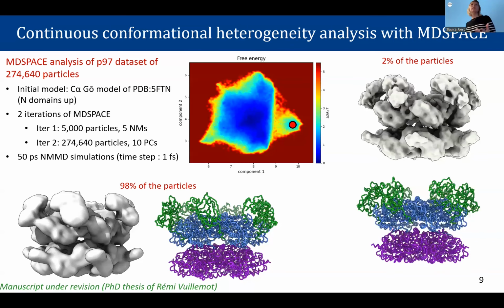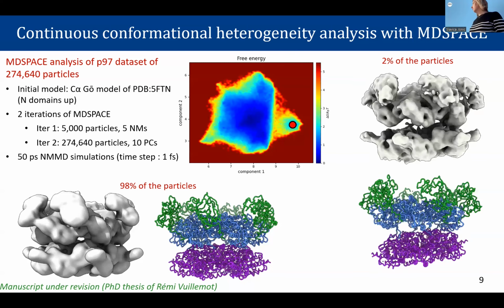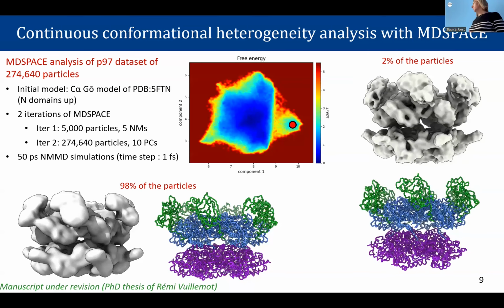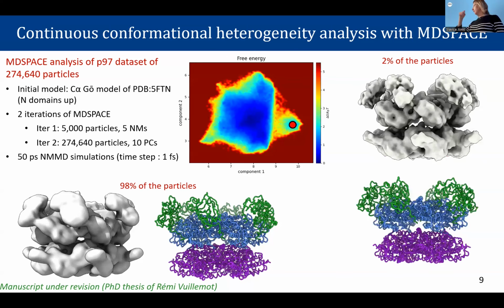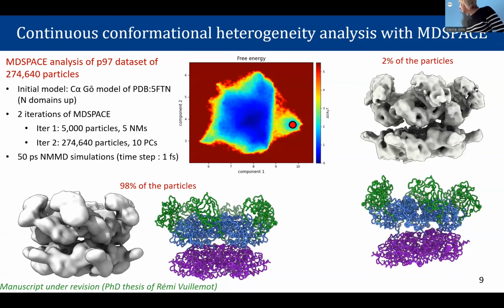We have 3 Cartesian coordinates for each atom, and then this representation is obtained with Chimera. So probably some other packages also know how to visualize the atoms. So the atoms are connected. By the way, this is not a full atomic structure.